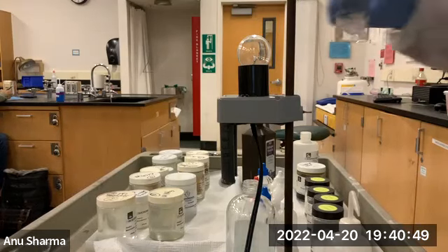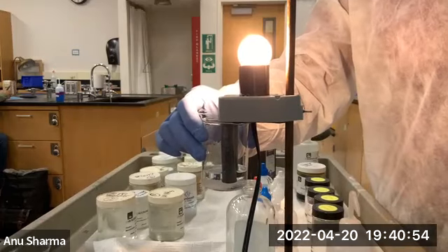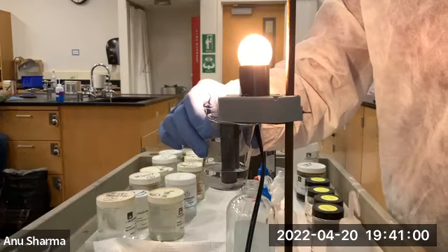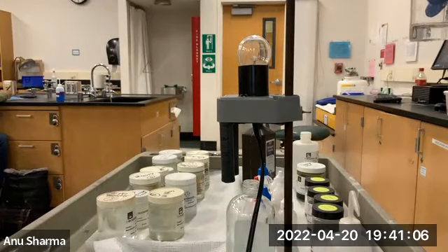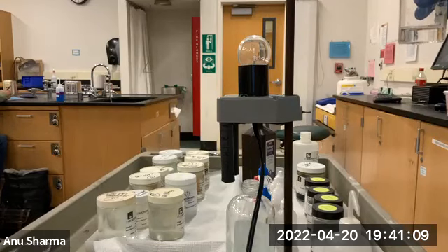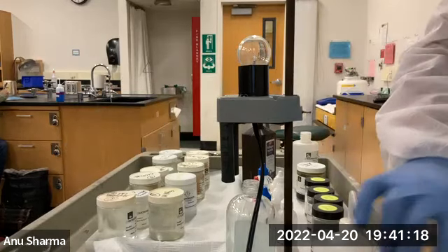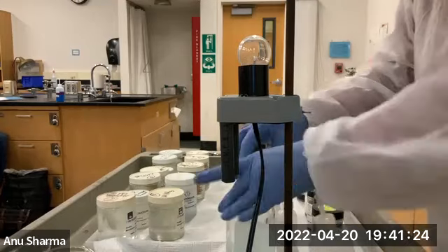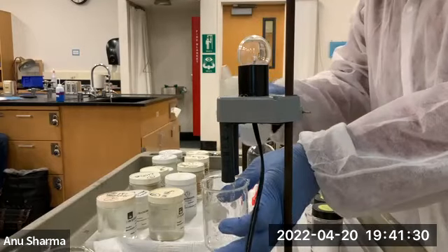Now let's look at the electrolytes. The bulb is lighting up, so it's a strong electrolyte. The sodium ion breaks up and the bicarbonate ion breaks up. The major species are the sodium ion, Na+, and the bicarbonate, HCO3 minus. Any questions so far? Any questions, guys? All good? Okay, let me just clean this.